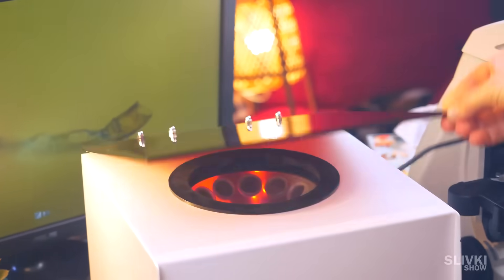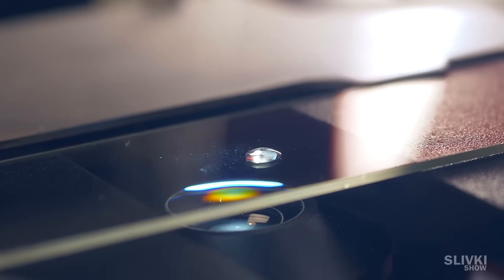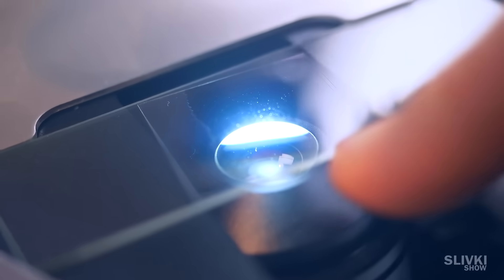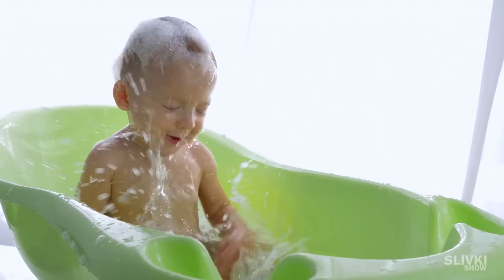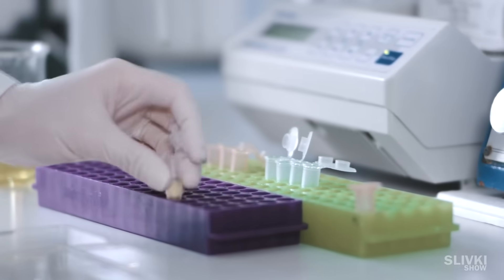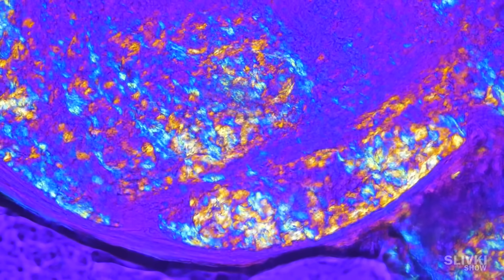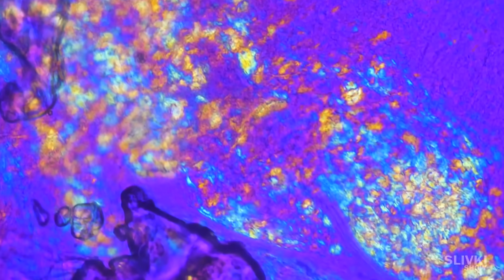By the way, I'll address the comments from viewers under the last video who said things like 'what you showed here under a microscope and now pimples.' Guys, researchers shouldn't stop at childish reactions like that. We're watching and showing something that might be interesting no matter how pleasant it is or not, in everyday situations. Even with pimples, we've already seen that such objects under magnification can look very attractive.